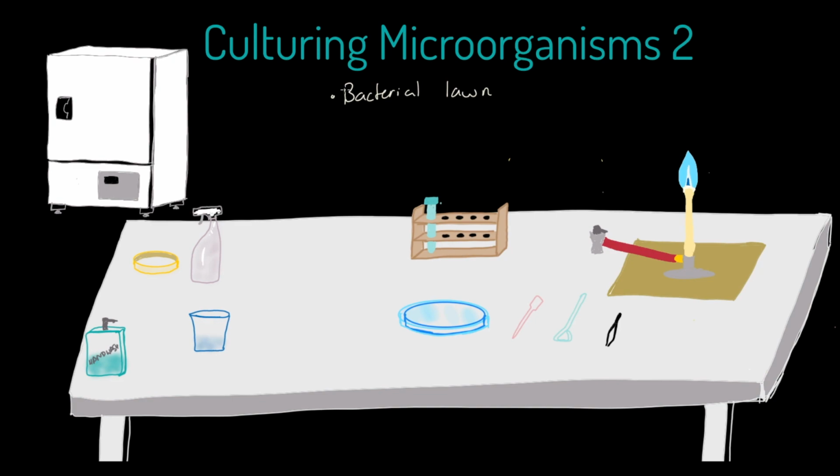The other point I want to make here is that we're looking to measure effectiveness. We're looking specifically to measure the effectiveness of antibiotics, or it could be antiseptics. I'm going to refer from here on in to antibiotics, but it will vary depending on the school that you're in, what you're using.